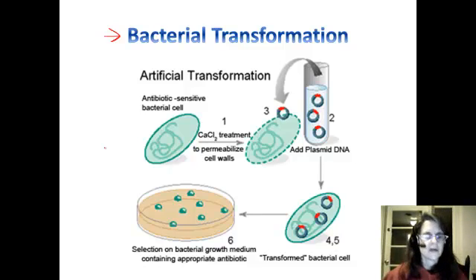What we will do is we are given by Bio-Rad some bacteria, some normal E. coli. Well, they are highly genetically engineered E. coli. They are very weak. They are not disease-causing in any way. They won't survive outside the lab. But this is the bacteria, and they are completely normal. They don't have anything funny about them.